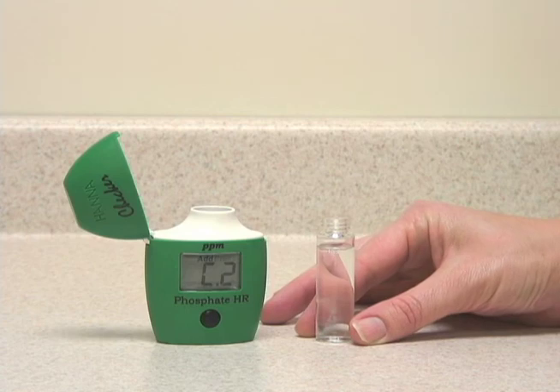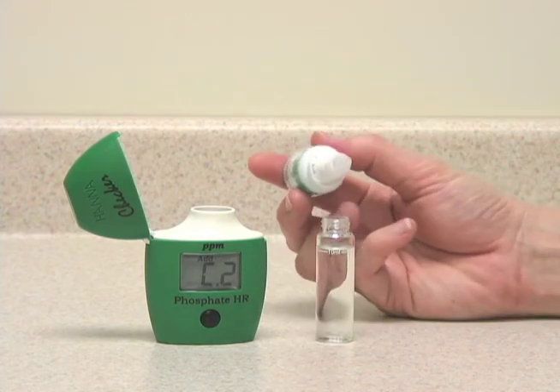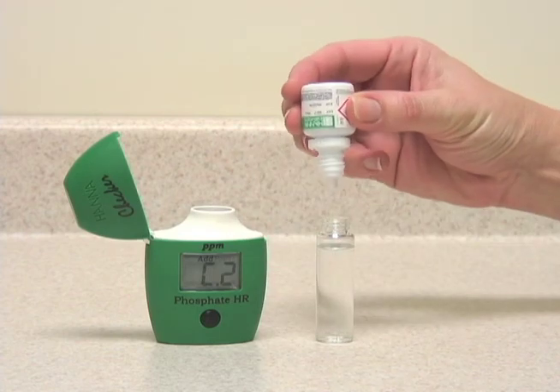Now we'll react the sample. This is a two-part reagent, so we'll take the first reagent, which is liquid, and we'll add ten drops.